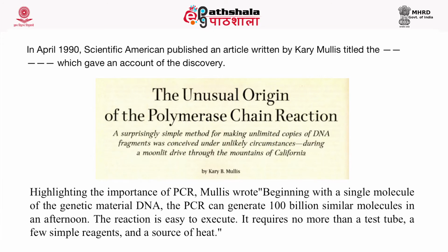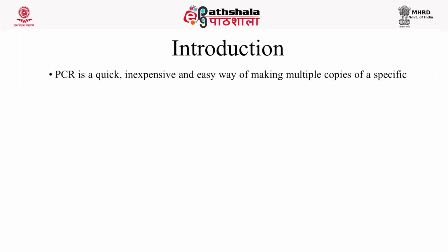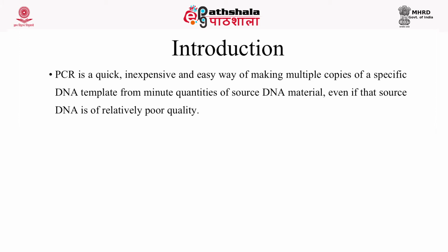Highlighting the importance of PCR, Mullis wrote, beginning with a single molecule of the genetic material DNA, the PCR can generate 100 billion similar molecules in an afternoon. The reaction is easy to execute. It requires no more than a test tube, a few simple reagents and a source of heat. Now let us discuss the simple technique of PCR, which is very useful in molecular diagnostics. PCR is a quick and inexpensive way to create a number of copies of a single DNA segment.